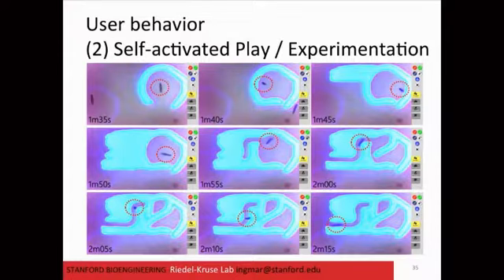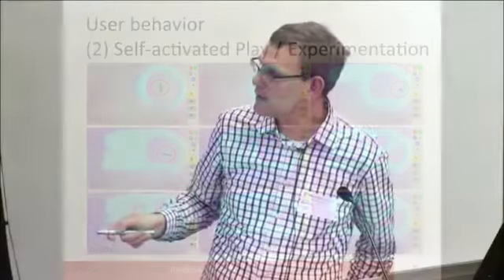Here you see an example where, within 2 minutes, this whole thing being an image sequence of 2 minutes, a person initially trapped one cell and then made a little maze and tried to get the cell out of the maze. So we can argue that we enabled a museum visitor to make a microfluidic circuit within 2 minutes without having ever done this before, doing a self-guided experiment.